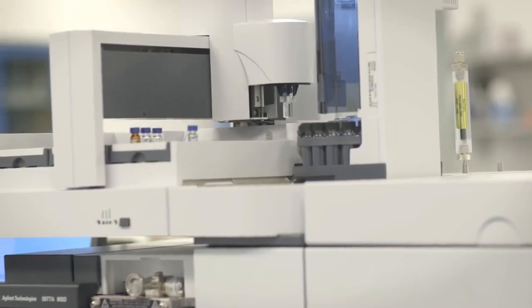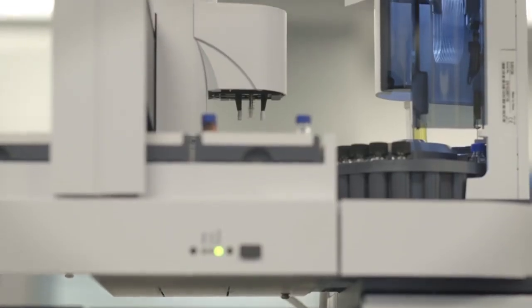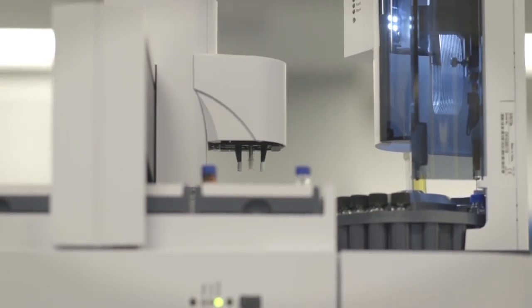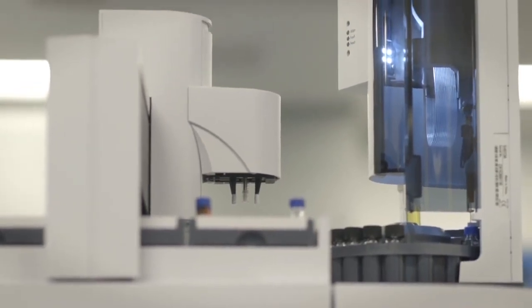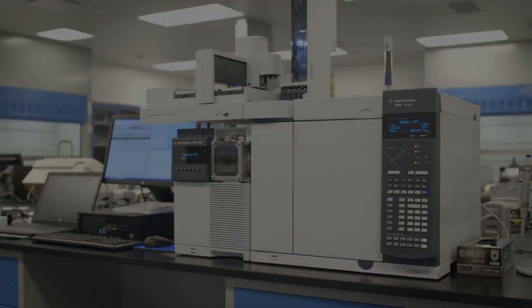From there, once it's separated, it actually goes right into the MS, which is the mass spectrometer, and the molecules are then fragmented with electricity. Those fragments are actually measured by mass. Each molecule is specific and it fragments specifically, so the detector can actually tell what mass and from there tell us the molecule.